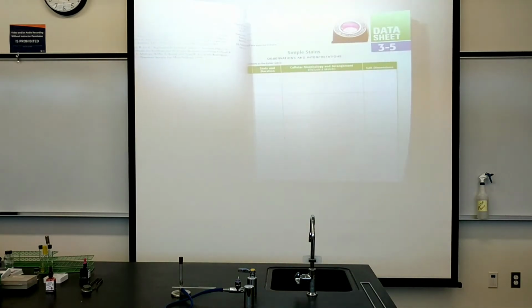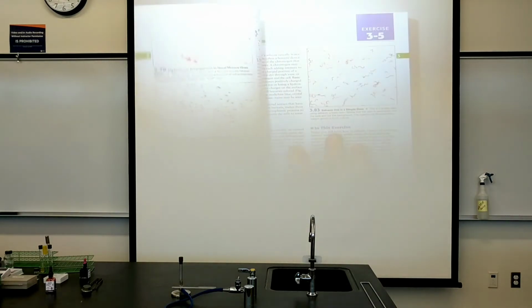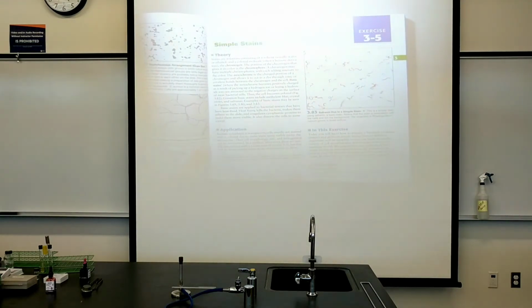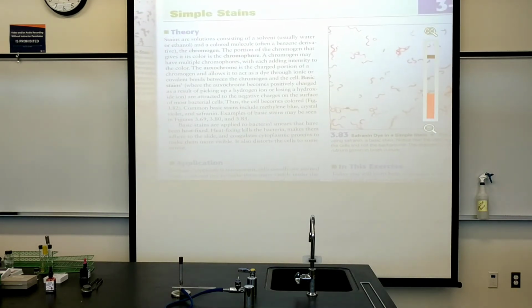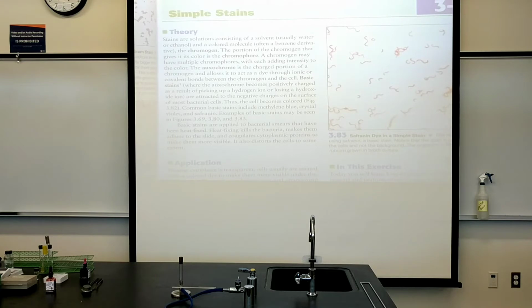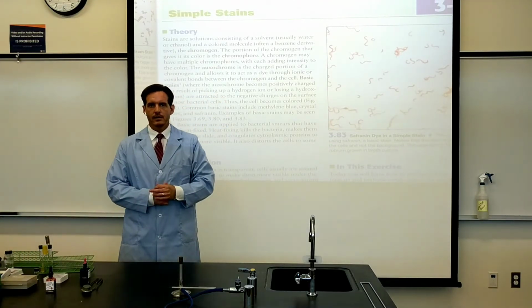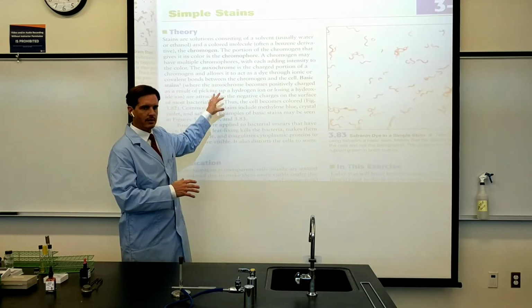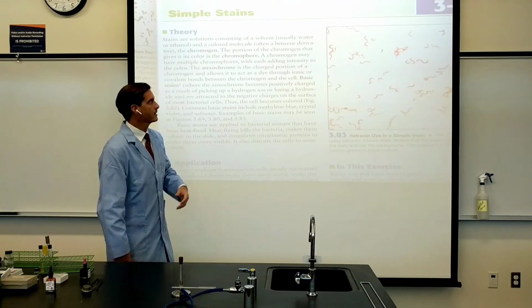And in here, let's look at the simple stain. Okay, so we'll zoom in for just a little bit here, and we'll take a look. All right, hopefully you guys can see this okay. And as I said, I'm going to just read off a little bit about this because it shows how my teaching style works.